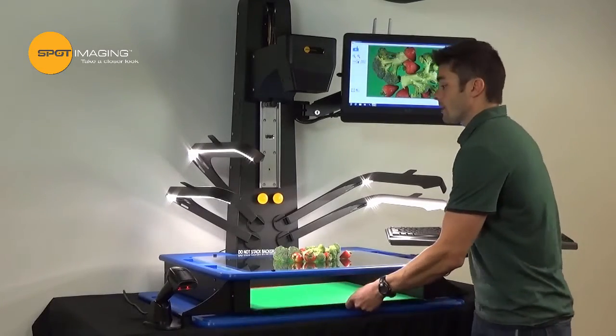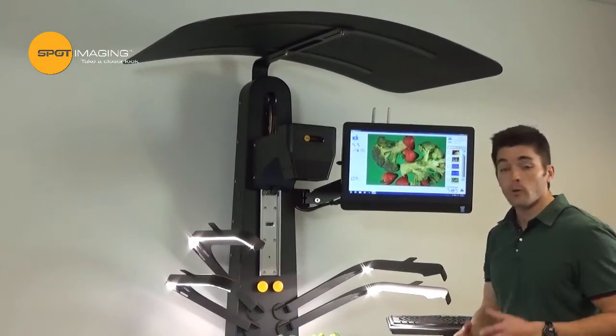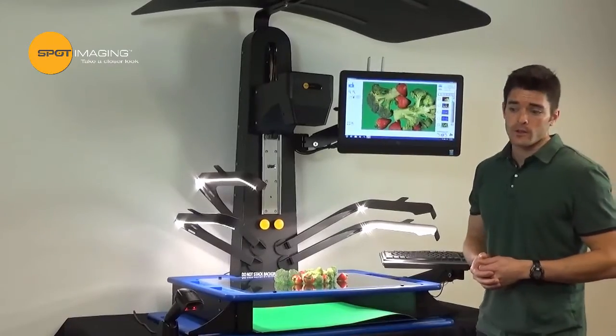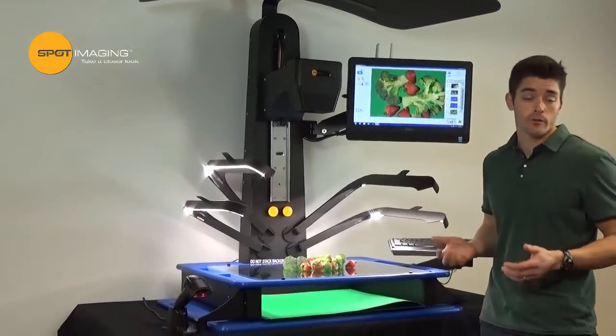We've also added this environment shade, which prevents room lighting from contributing to unwanted glare in your image. As any good photographer will tell you, lighting is critical. We learned a lot from our previous stands and spent a lot of time developing a lighting system that can be configured to handle any type of specimen you throw at it.